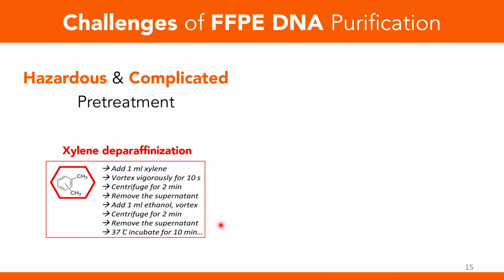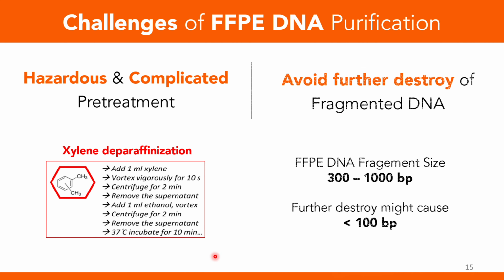One, because FFPE needs deparaffinization, and normally people need to use xylene, which is a hazardous chemical, and also the procedure is very complicated. It's a long procedure, so it's a hazardous and complicated treatment.